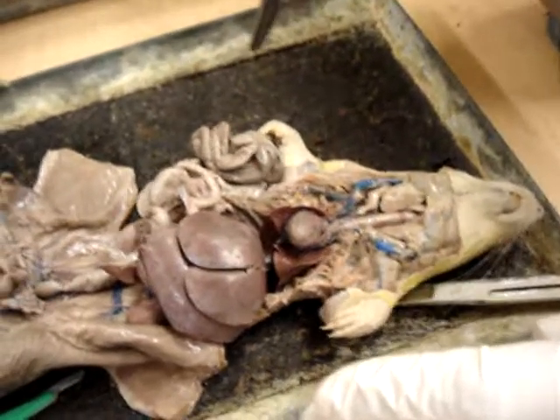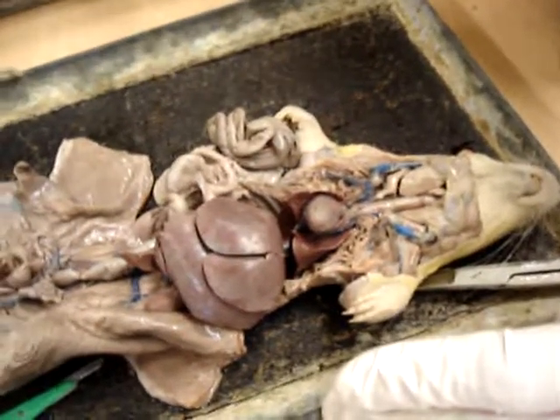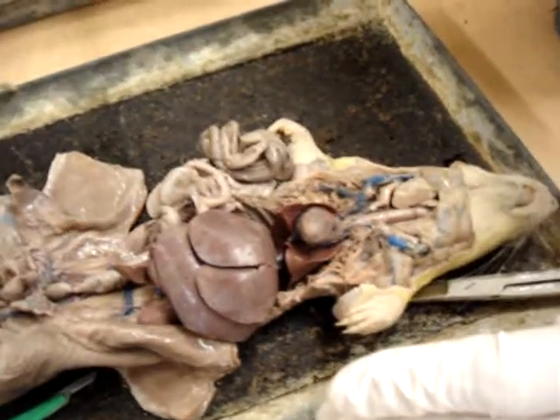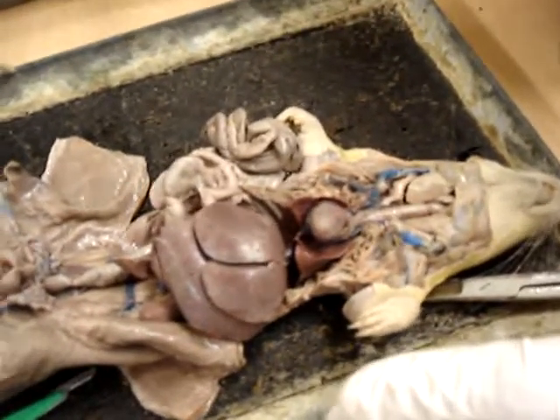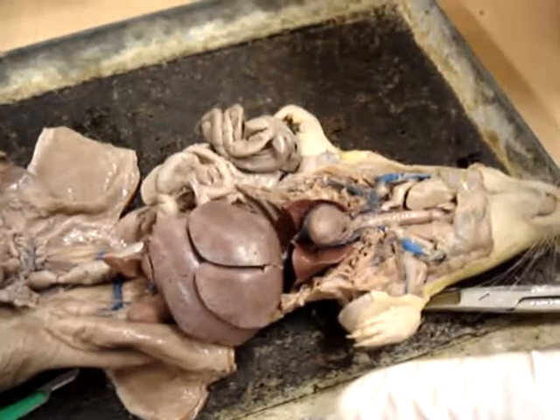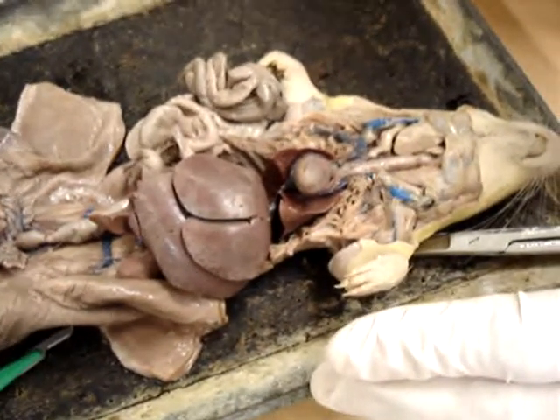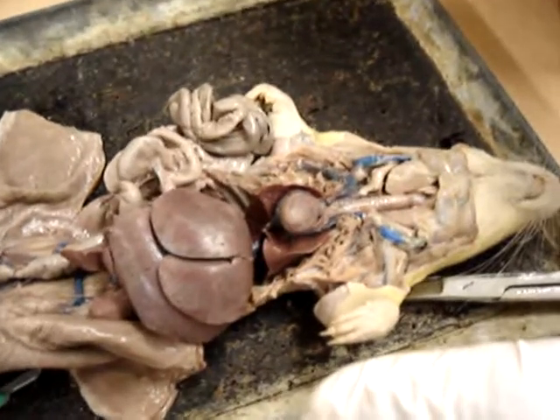Today we're going to go through the rats. This is Phylum Chordata and Subphylum Vertebrata, Class Mammalia, and the genus is Rattus, R-A-T-T-U-S. First, we're going to go through the circulatory system.